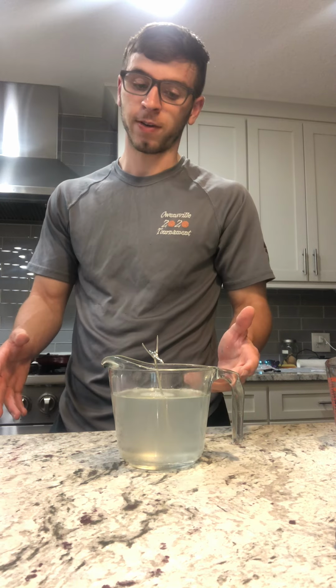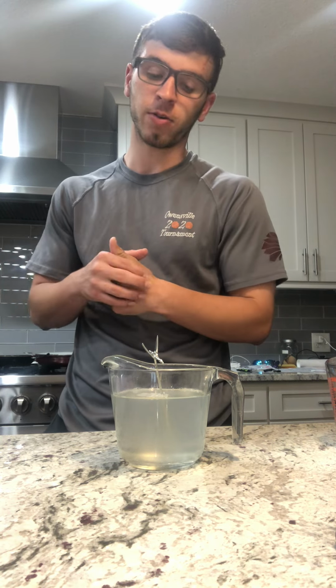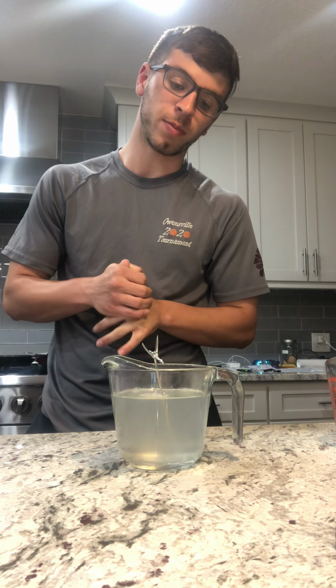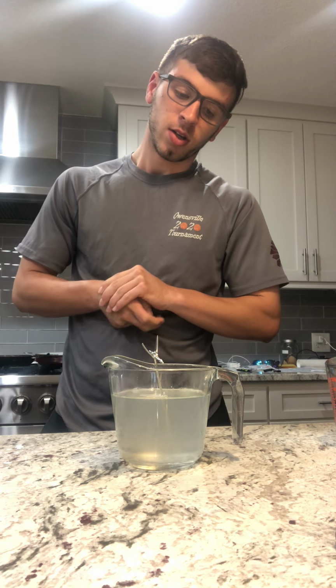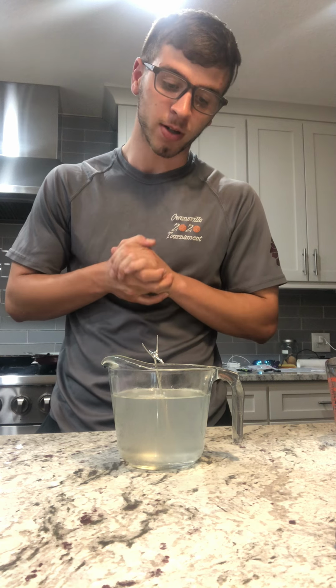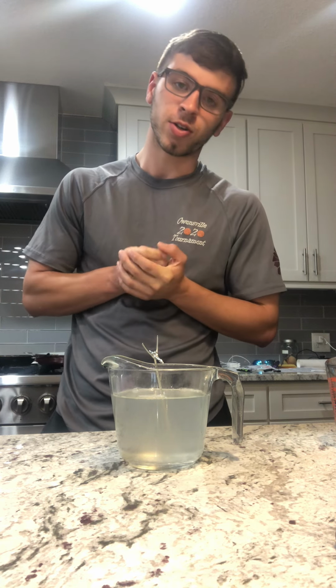But if I would have decreased it, maybe just used one. I used 2 tablets of 1,000 milligram vitamin C. If I would have just used one, it probably would have changed the speed of it quite a bit. So sorry we couldn't get it to react within our time frame, but hopefully next time when I try it again it'll work.